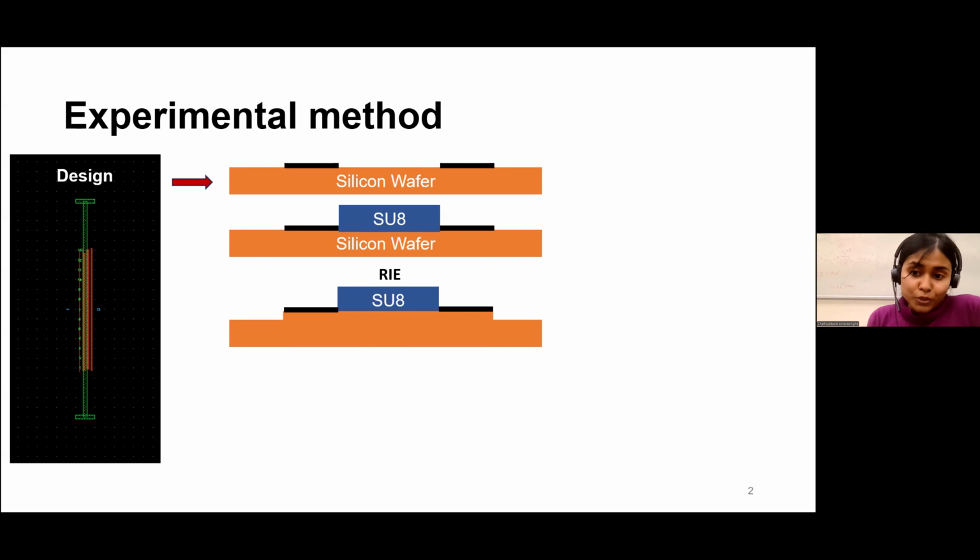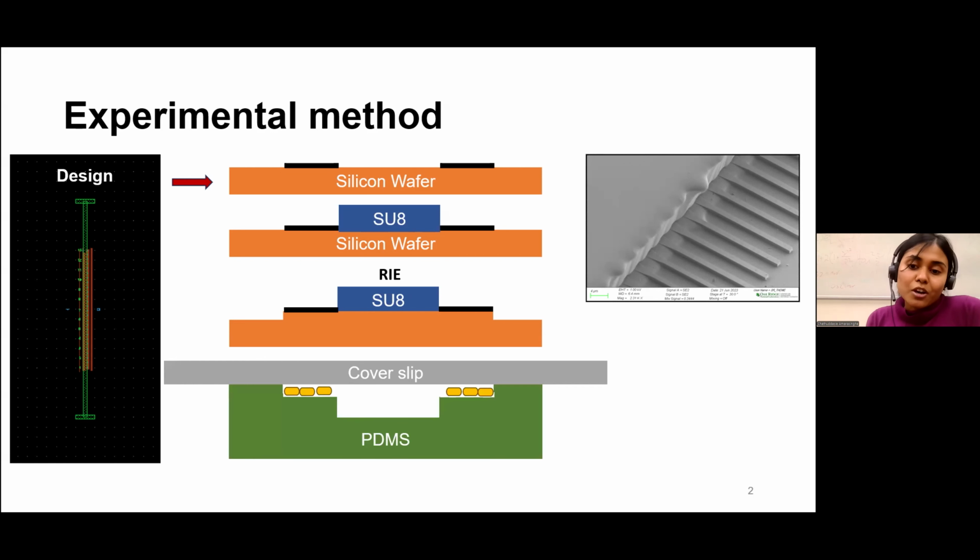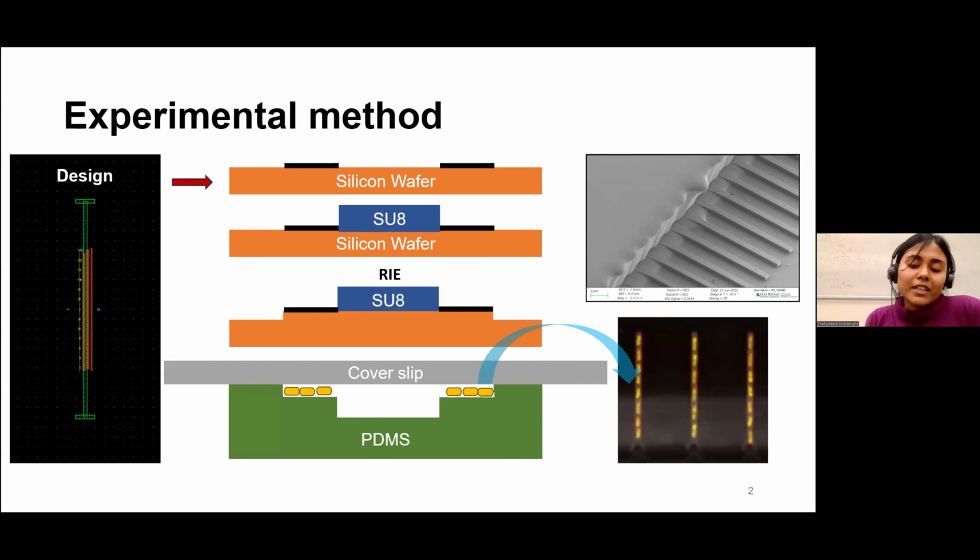Using E-beam and photolithography, we make patterns on silicon wafers, and these silicon wafers will then be used as molds for PDMS-based microfluidic devices. Our design consists of a larger main channel, shown in green in the design, that allows media flow, and then there are side channels on either side of the main channel where E. coli cells will reside during the experiment. The dimensions of the side channels are very important because if it's too tight, the cells won't grow normally, and if it's too large, they will move around.